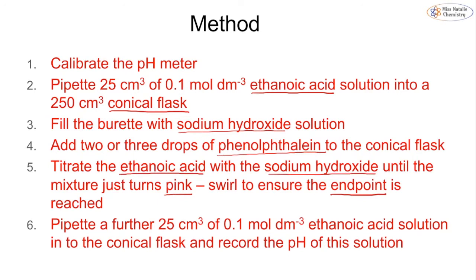It should be a permanent pink colour, and we swirl it just to make sure that the endpoint is reached. If it goes pink and then you swirl it and it goes back to colourless, you are not at the endpoint. The pink colour has to be permanent. Once we've got that endpoint, we then pipette a further 25 cm³ of our ethanoic acid and then we record the pH of the solution using our pH meter.